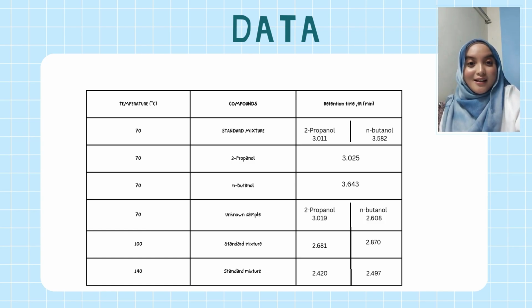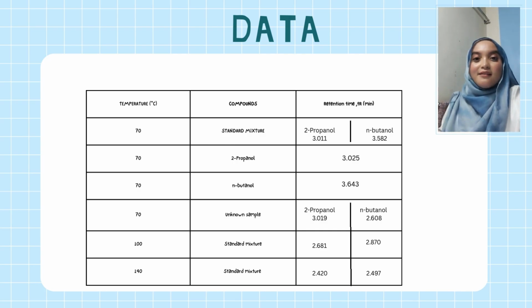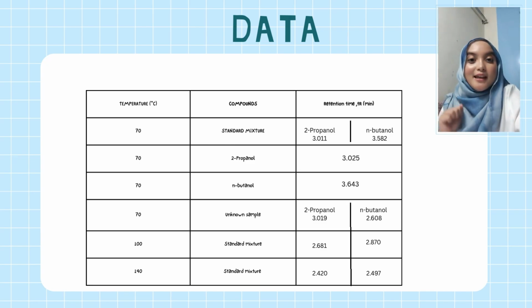At 100 degrees Celsius, the standard mixture showed lower retention times of 2.681 minutes for 2-propanol and 2.870 minutes for N-butanol.